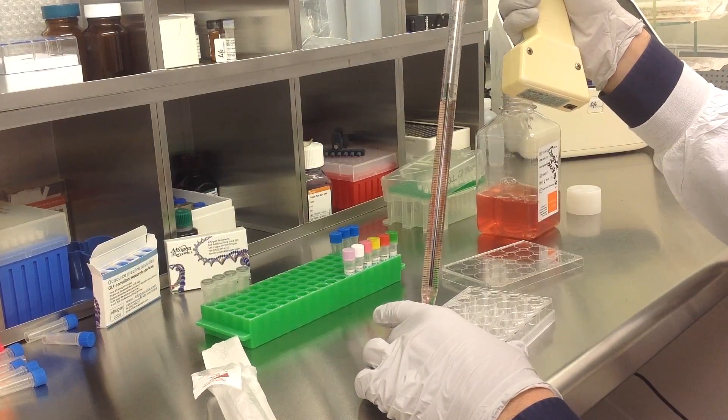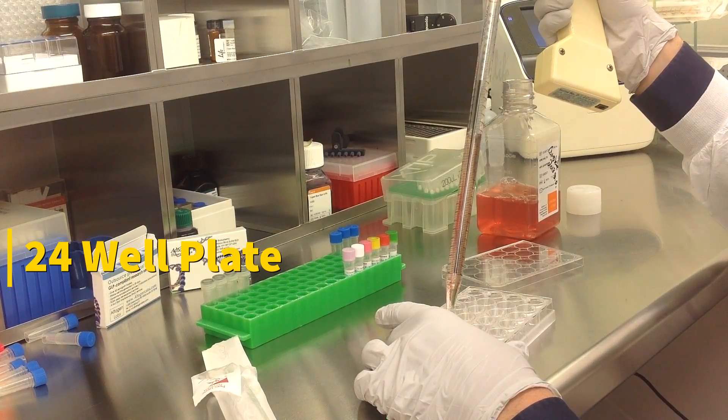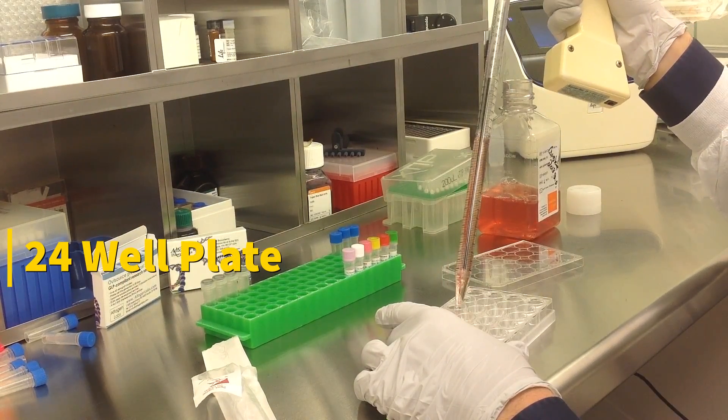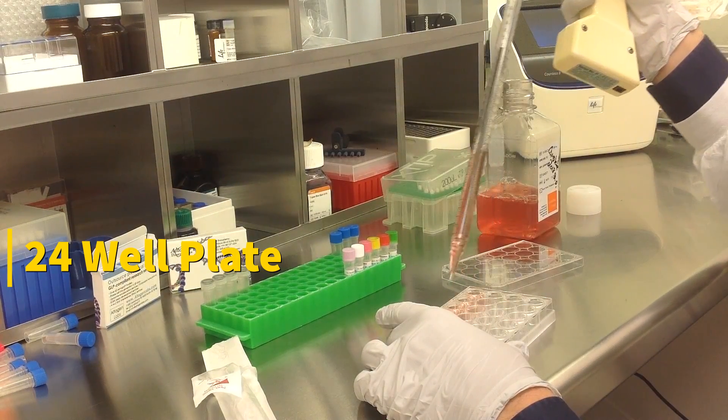Today we will be transfecting BHK21 cells obtained from ATCC, using a transfection kit manufactured by Altagen BioSystems. In this tutorial, we use a 24-well plate. Transfections can be scaled up or down based on plate surface area as described in the corresponding transfection protocol, which can be found at altagen.com.